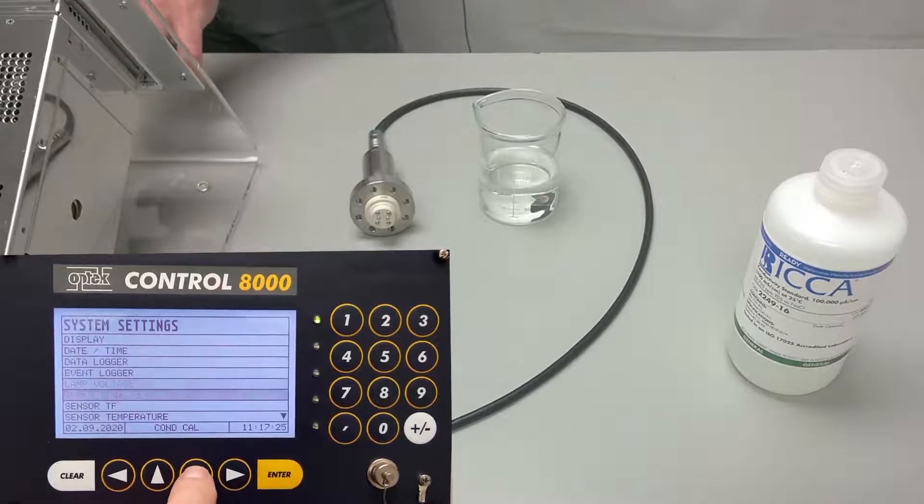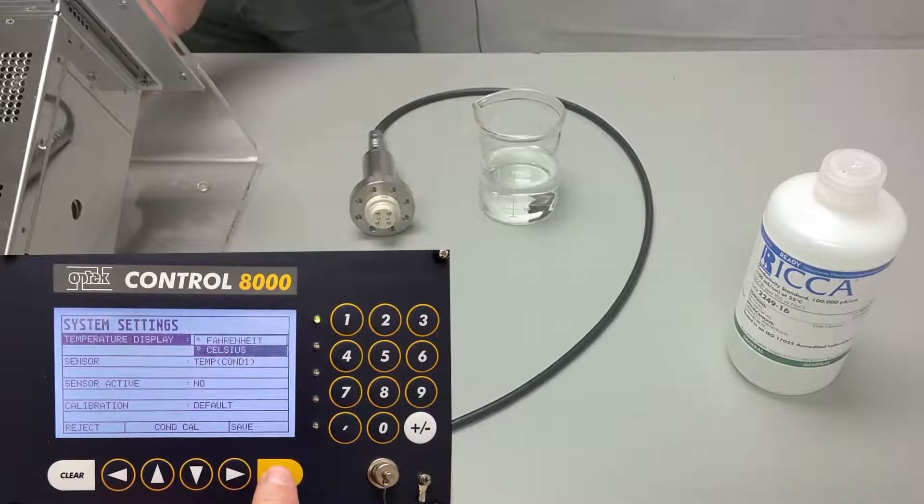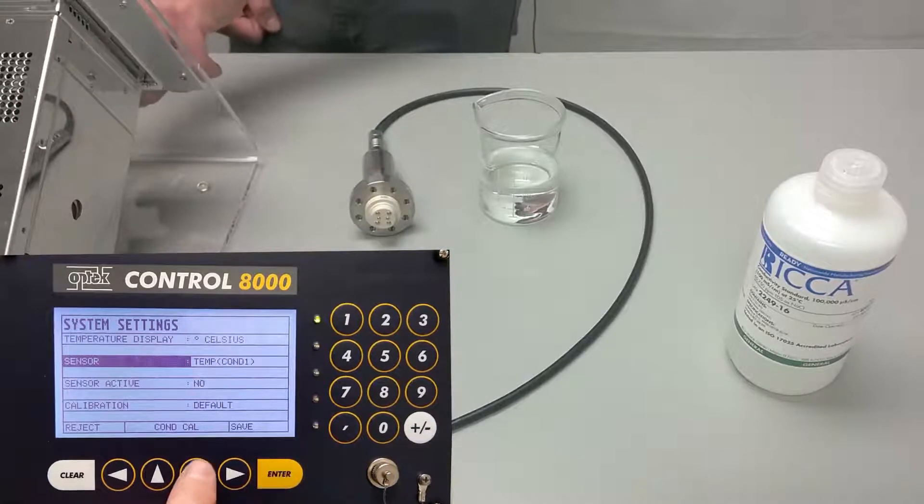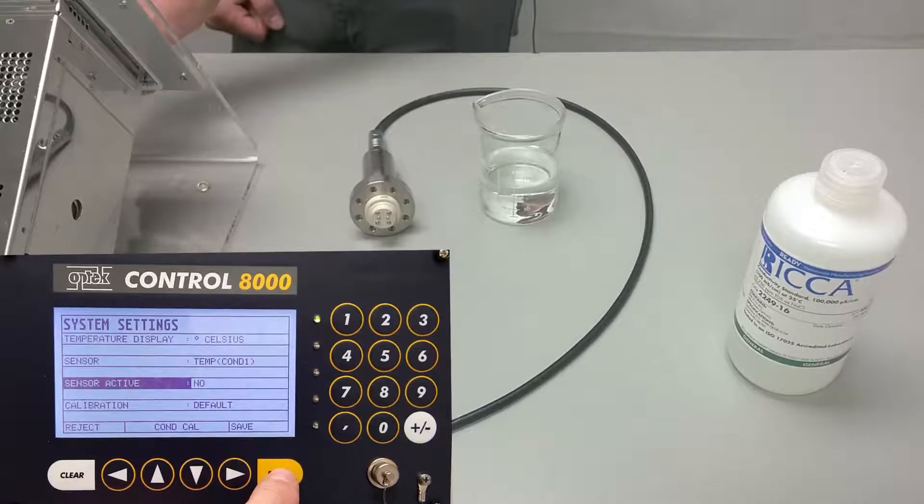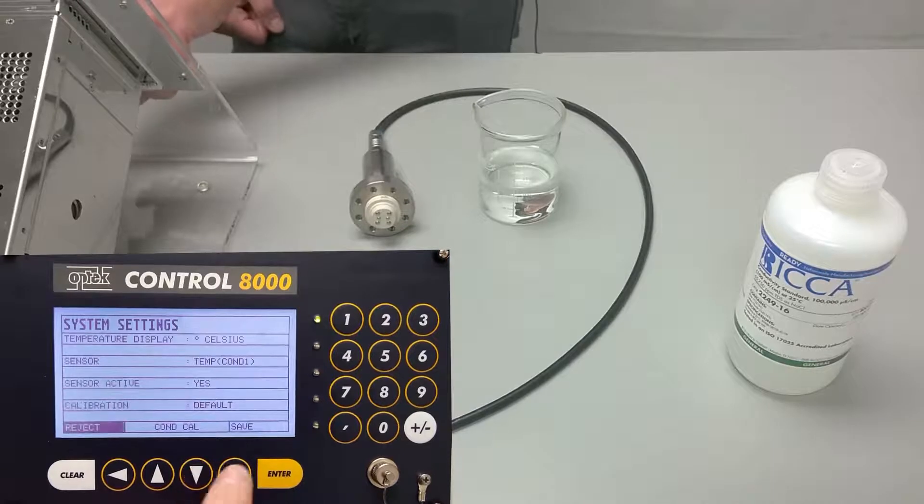Scroll down to sensor temperature. If we wanted to change from Fahrenheit to Celsius, this is where we could do that. We want to ensure that COND1, which is the sensor we are calibrating, is selected. Scroll down to sensor active and change this to yes, then scroll down and press save.